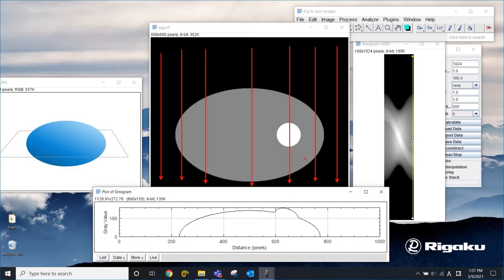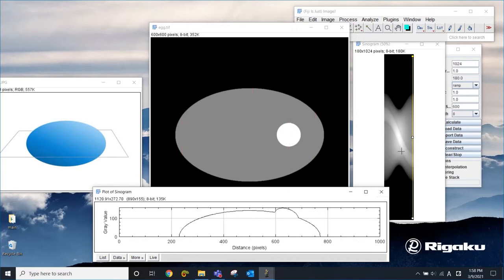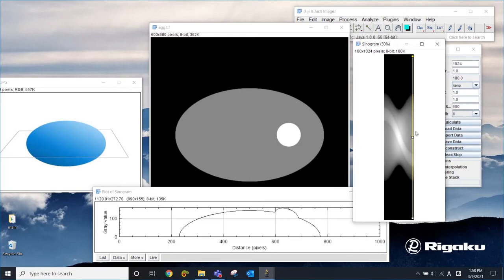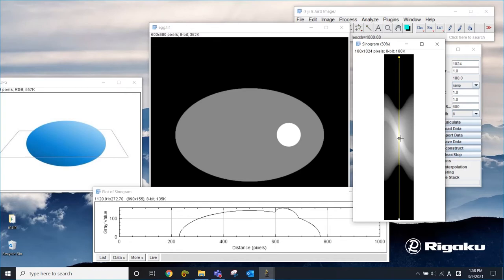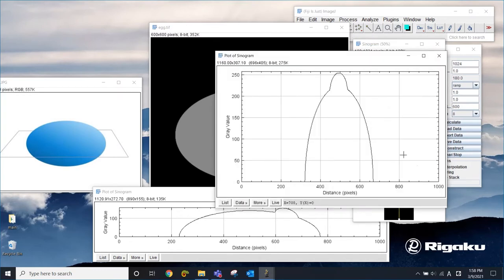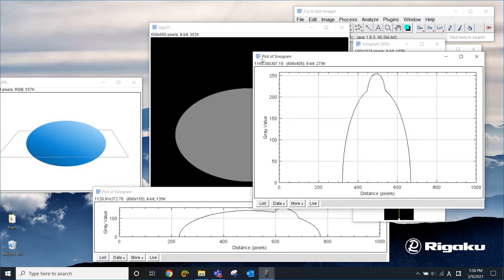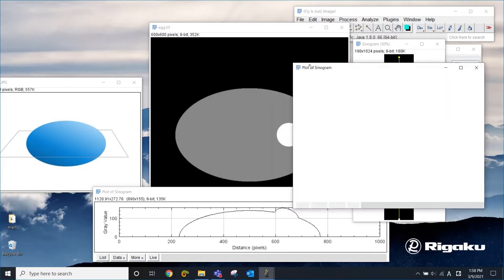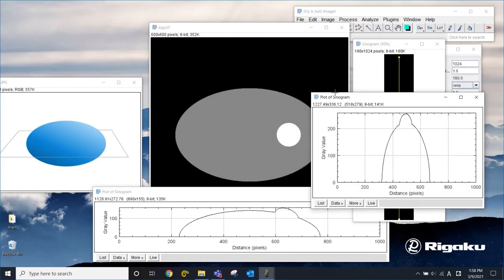Now, if you look at a different spot, let's look at here. This is 90 degrees. Look at the projection. Now you get something like this.